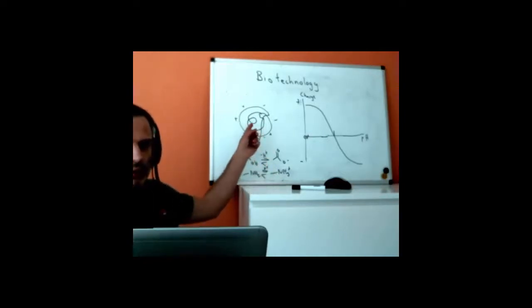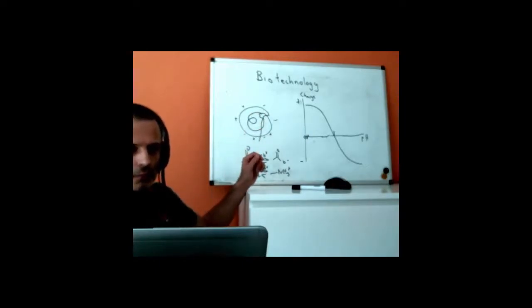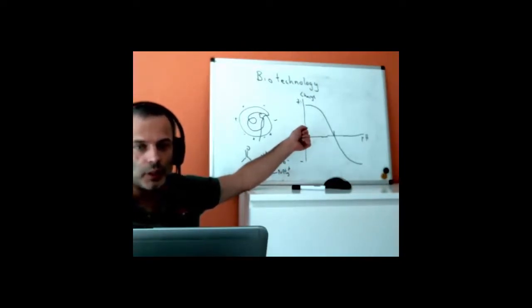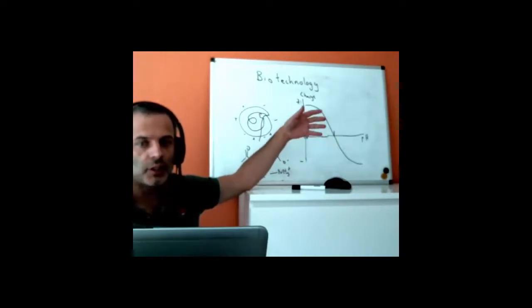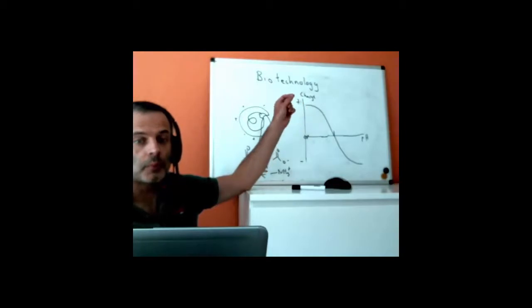That gives us a mixed positive and negative charge all over the molecule that varies depending on pH. So if we look at the charge to pH, we can see that at some pHs, at low pH, it's typically positively charged, at high pH it's typically negatively charged, and at some pH it will have a net zero charge, although there will still be positive and negative charges, they just balance.